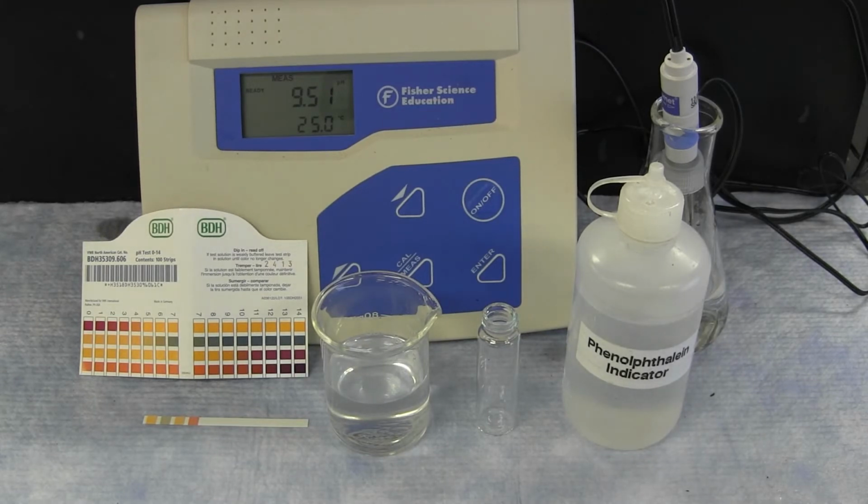The pH of a solution can be measured by three different methods: pH indicator, pH paper, or a pH meter. The solution in the beaker is a solution of sodium hydroxide.